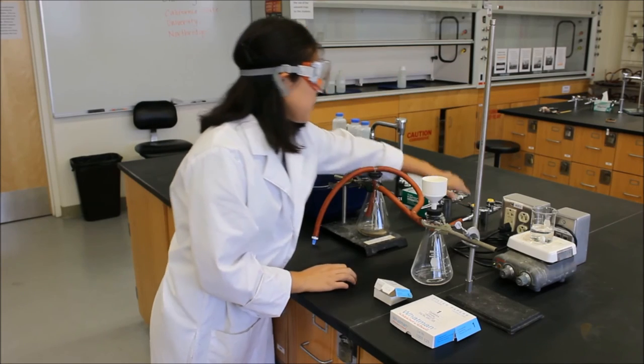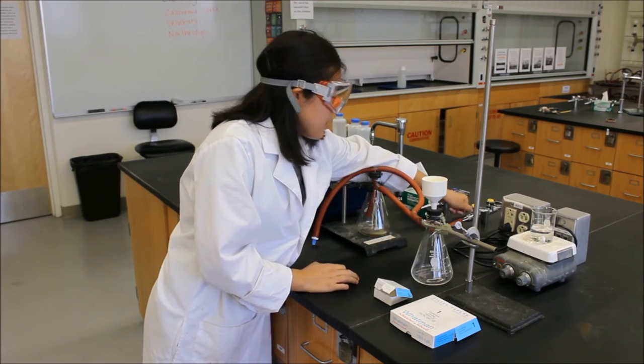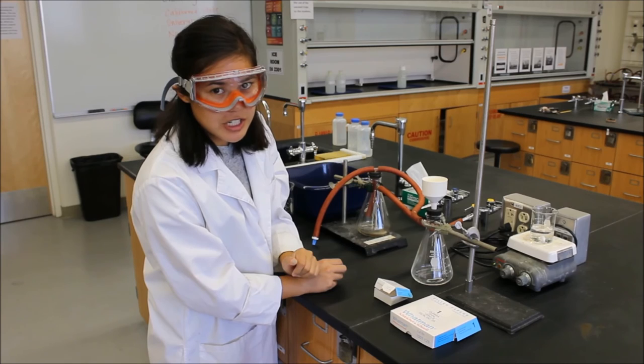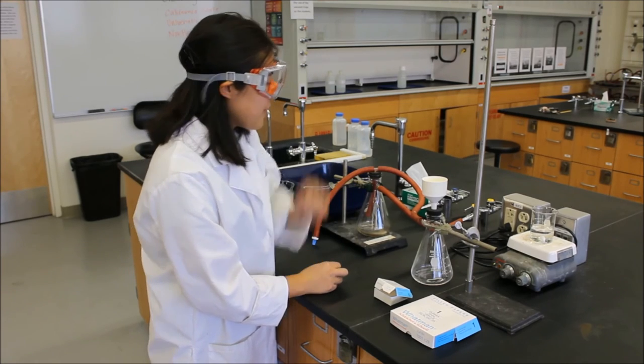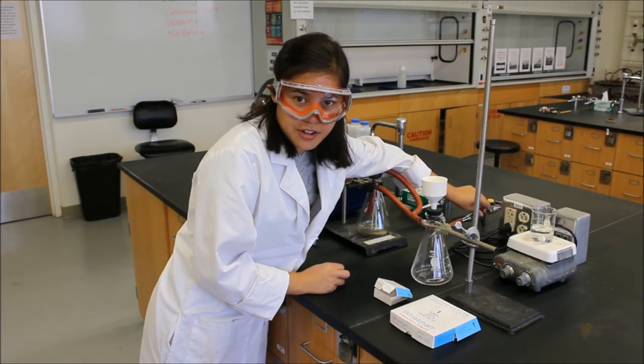Once they're connected and everything's all good, you can go ahead and turn on the vacuum. Remember, it's on when it's pointing in the same direction that the tubing is going. If you turn it too far, it'll just turn off.